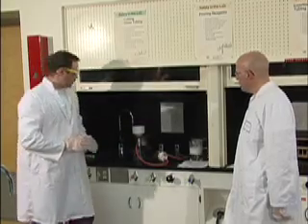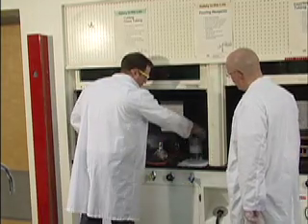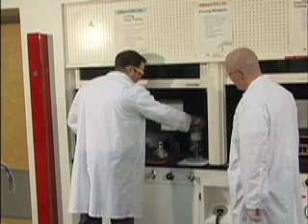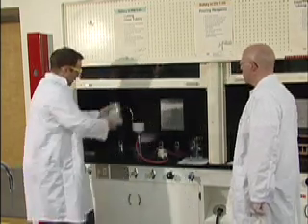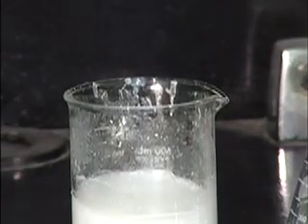Now, with your crystals. Sorry guys, I know I'm right in the way. Your crystals are in a beaker. If you've left them for long enough, they will be fairly solid in that beaker. So what you're going to do is take your spatula, your plastic stir rod, and just go around the outside of the crystals to release them from the side of the beaker.